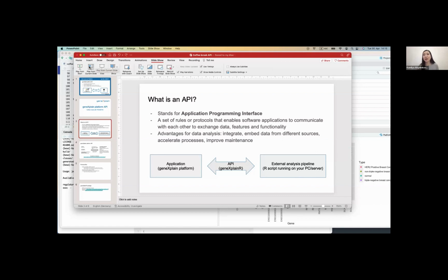That's why we have our platform: for researchers and scientists to spend less time figuring out these operational things and focus more on the results, on what insights the data actually gives you, to be more focused on the scientific, innovative side of your research, rather than doing these manual things.